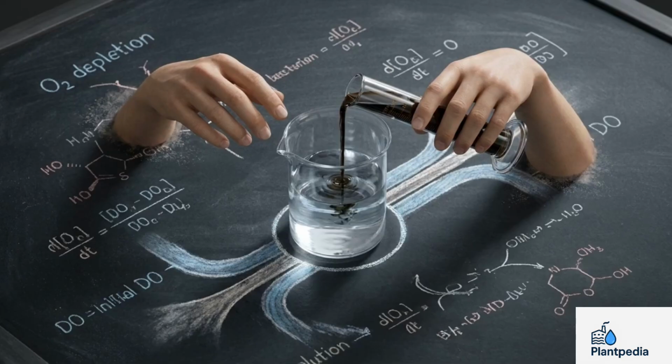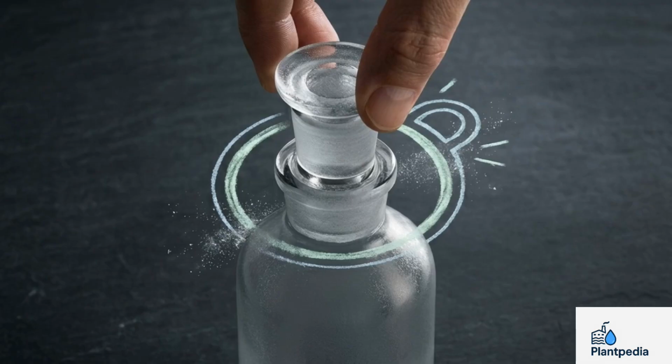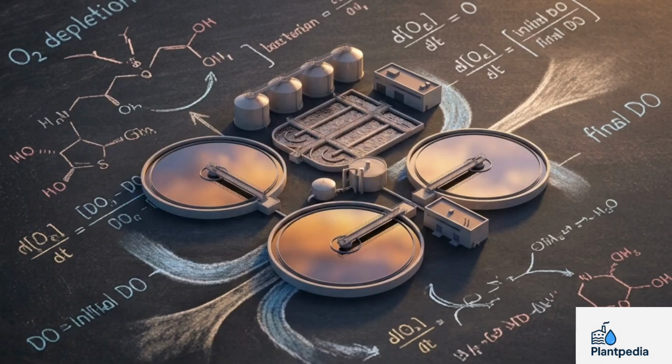By accurately preparing the dilution, securing an airtight seal, and performing the correct math, you produce the reliable metrics required to meet legal environmental standards while maintaining plant efficiency.